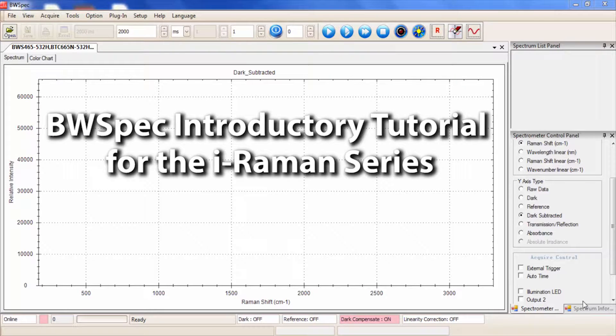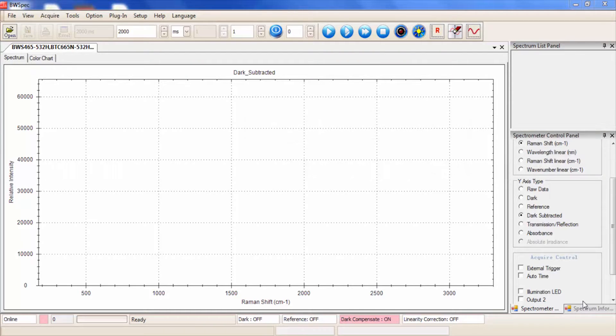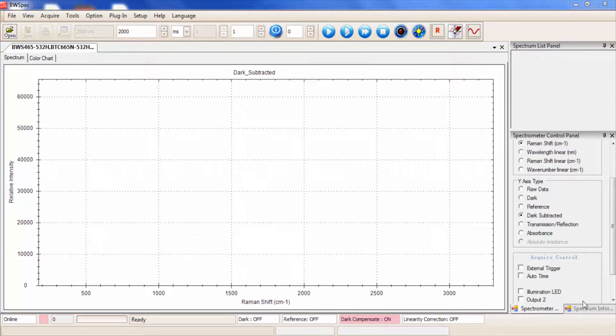Welcome to the BWSpec tutorial video with iRaman. At this step, your instrument should be set up with the unit drivers installed.